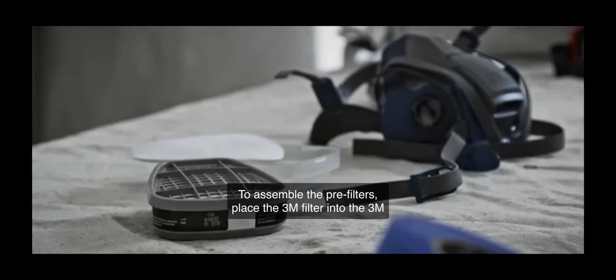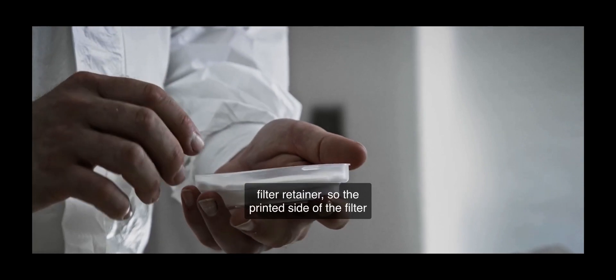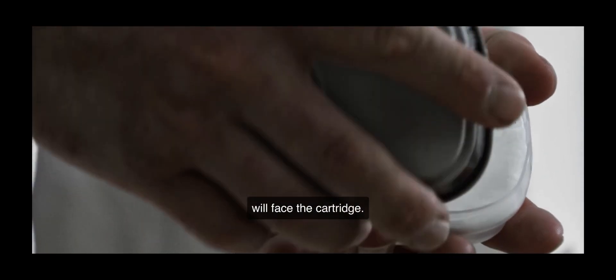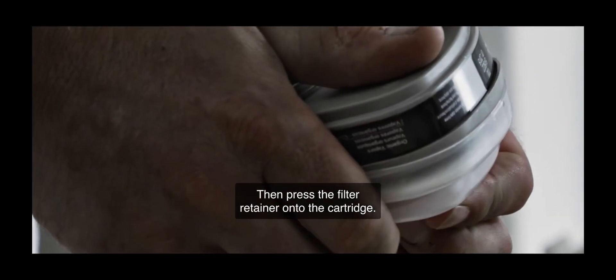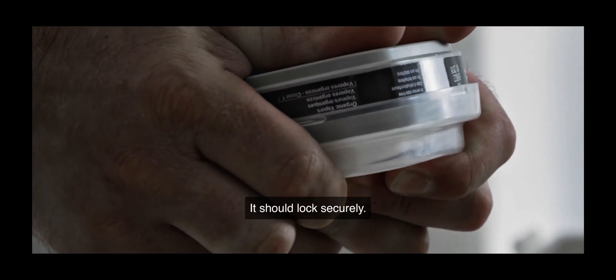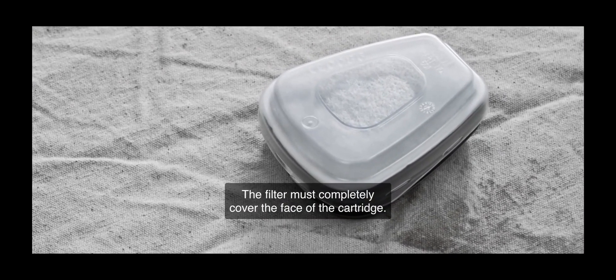To assemble the pre-filters, place the 3M filter into the 3M filter retainer so the printed side of the filter will face the cartridge. Then press the filter retainer onto the cartridge — it should lock securely. The filter must completely cover the face of the cartridge.